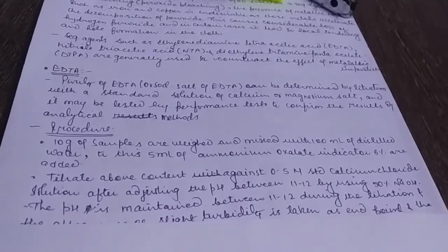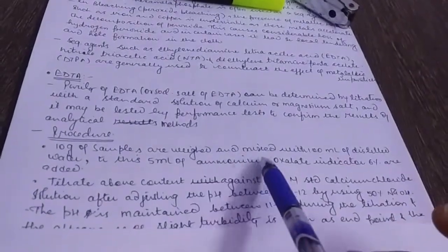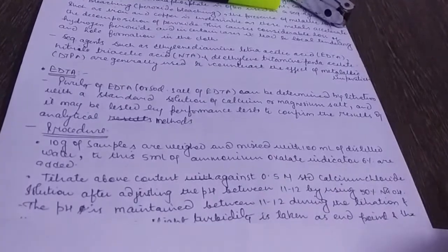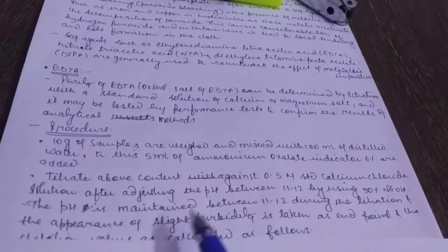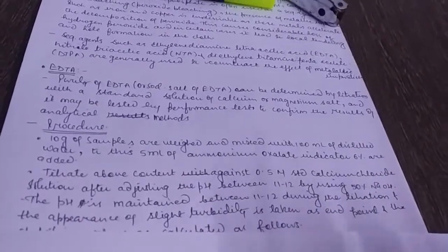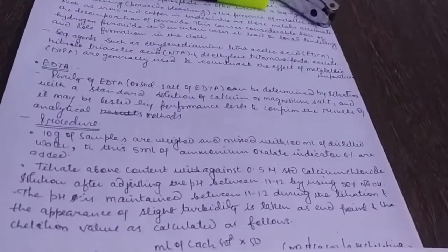So as you add the calcium chloride solution to the content, meaning the sample, distilled water and ammonium oxalate indicator, the solution gradually becomes slightly turbid. You should carefully watch and wait. The appearance of slight turbidity is taken as the end point, and the chelation value is calculated by the formula below.